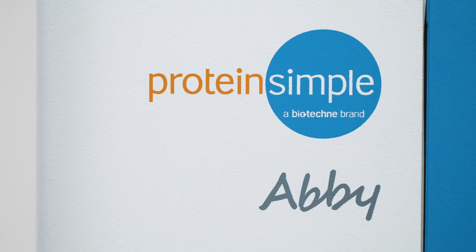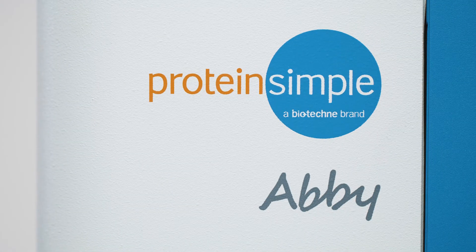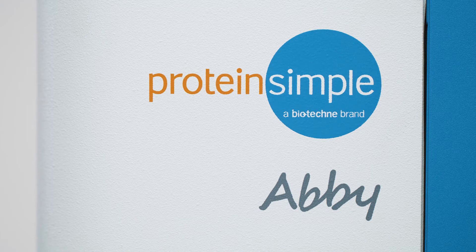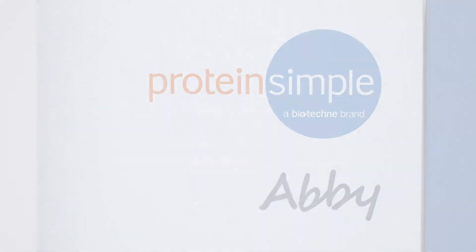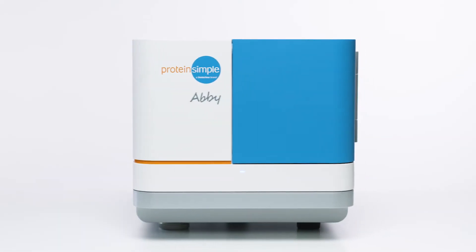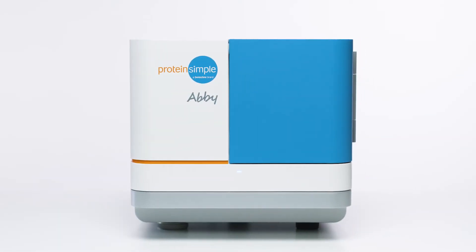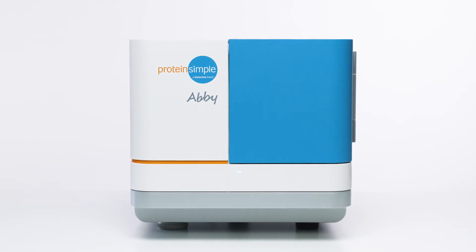Meet Abby, the next-generation automated Western protein analyzer. Abby automates the protein separation and immunodetection of traditional Western blotting, eliminating many of the tedious, error-prone steps.